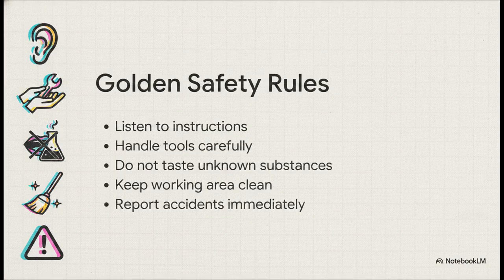Number 1, listen to instructions. Number 2, handle tools carefully to prevent accidents and damage. Number 3, do not taste unknown substances. Keep your working area clean. And finally, report any accidents immediately.